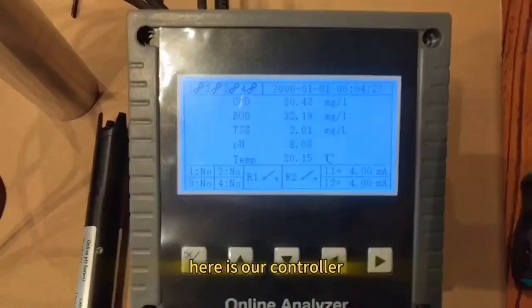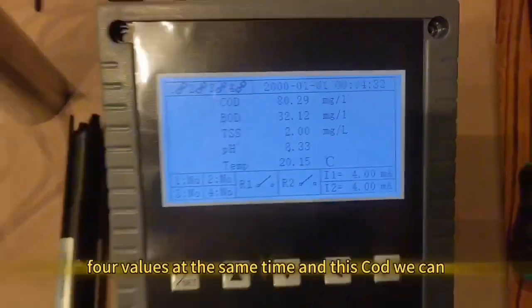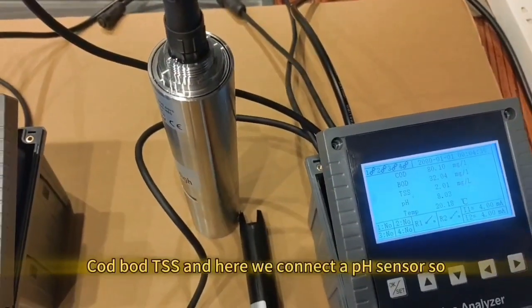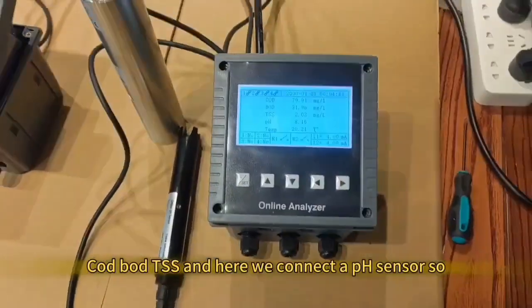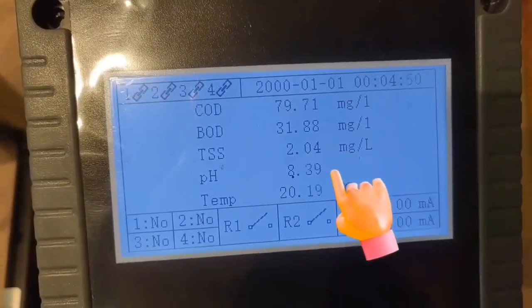Here is our controller. It reads four values at the same time — COD, BOD, TSS, and here we connect a pH sensor. So this controller reads the COD, BOD, TSS, and pH values together.